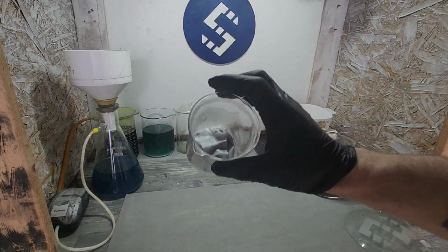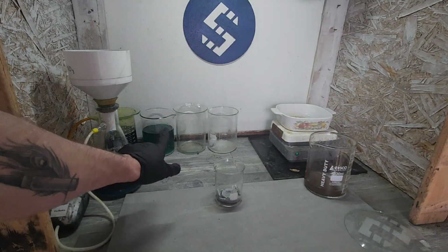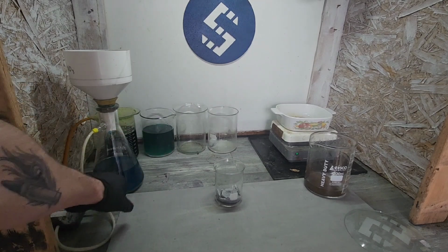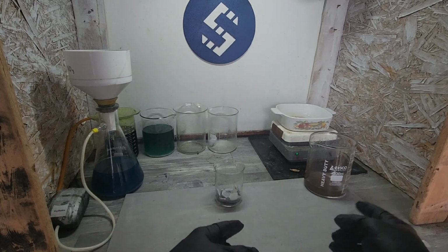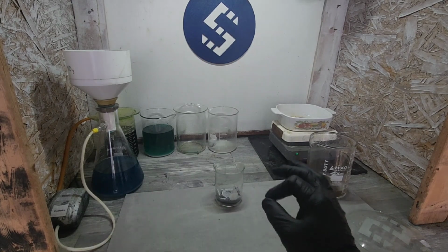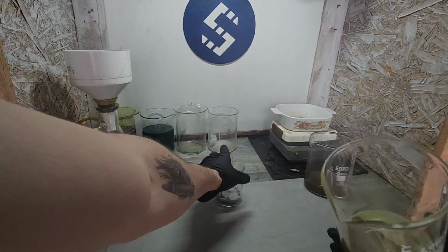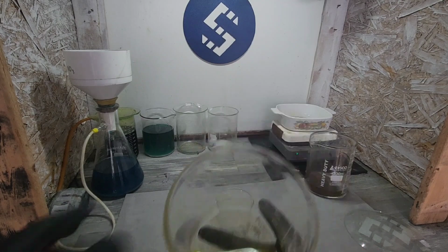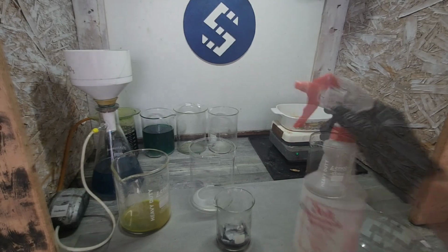So this is after that nitric boil. I just put it in the little beaker there. I cemented. Well, I didn't say cement. I precipitated silver chloride out of that, and I still have a couple filtrations I have to run on this. This is the nitric boils combined of the littles and the bigs. So now we're going to go ahead and go into Aqua Regia with the littles, and we still have the leftover Aqua Regia from here. Maybe I should filter that out. I think I'm going to do that. All right. Hold on.